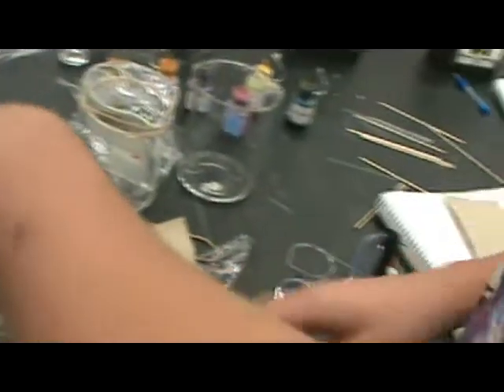Oh yeah. So this is 3, and now we need to start measuring. Okay, so to measure retention value, what you do is you find the center of these colored circles with the ruler, and then you measure the distance between that and the bottom solvent line. Just the center? Yeah, just the center, because a lot of these stretch out. And then that will be the distance traveled by the solute. Then we put that over the distance traveled by the solvent, which is the clear liquid.